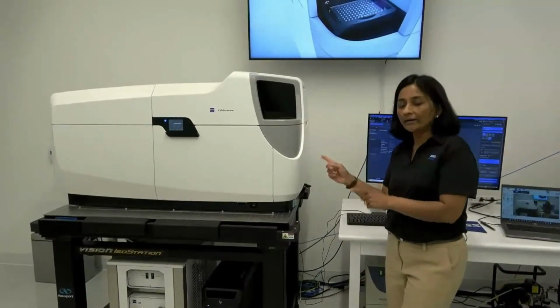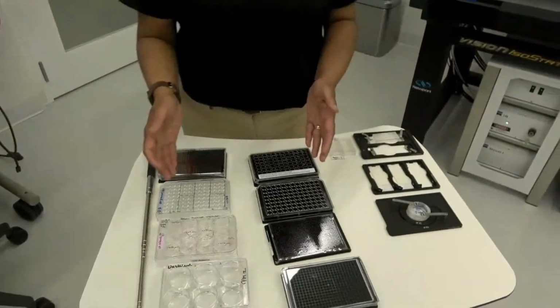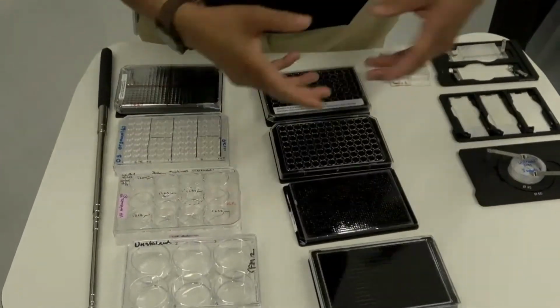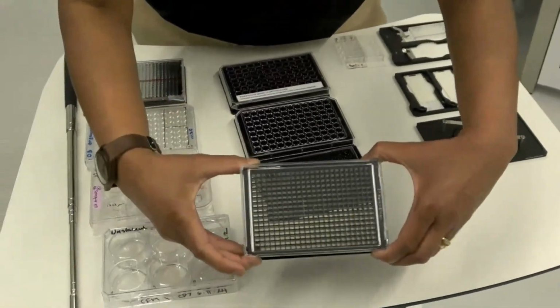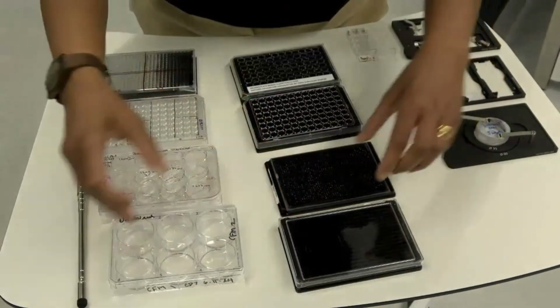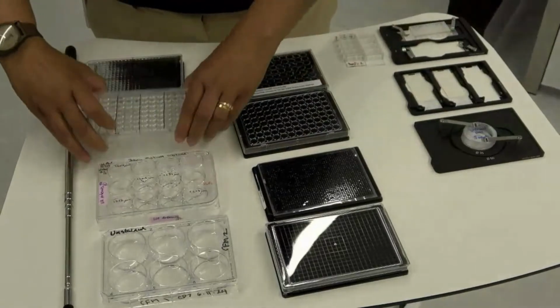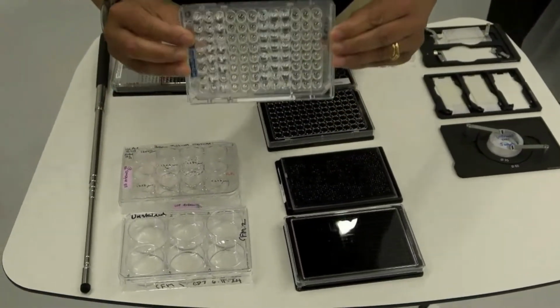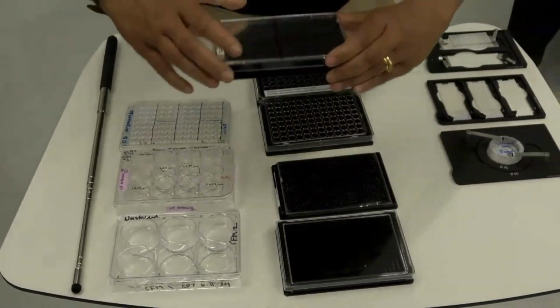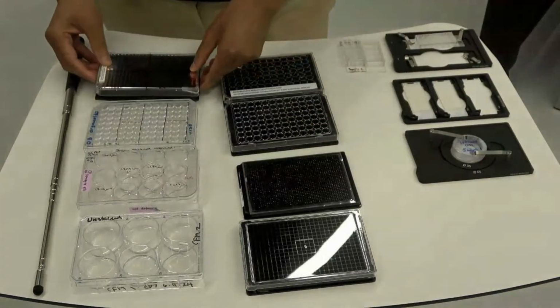And while it does that, let's pan over to this table right here, Michael, please, and look at all of the different well plates that we can image on the CD7. So, for example, you can have a 384 well plate, a 1536 well plate, a 6 well plate, plastic as well as glass bottom. This plate has a round bottom, and we utilize this for imaging organoids. Very recently, we have been collaborating with another company and imaging spheroids grown in their plates.